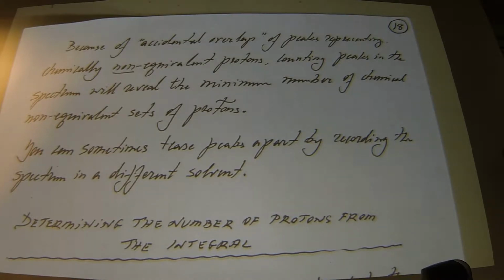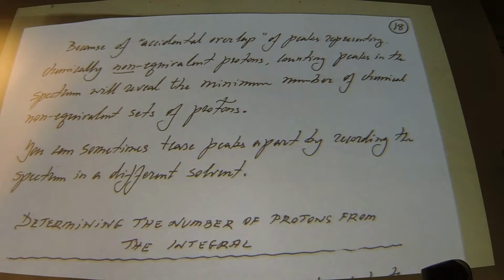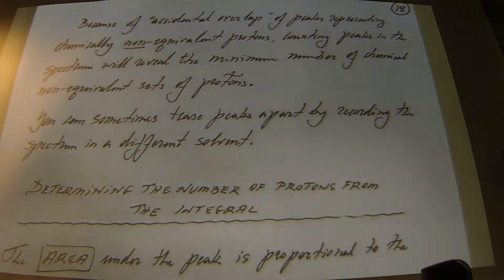Sometimes you can tease apart those peaks by changing the solvent. Okay, so the solvent that you record your spectrum in can have a big effect on the chemical shift. And big meaning, a tenth of a ppm, which is big, or maybe more. And so that's sometimes all you need to do. So you can sometimes tease the peaks apart just by doing the spectrum in a different solvent. There are 2 or 3 common solvents that you can pick.